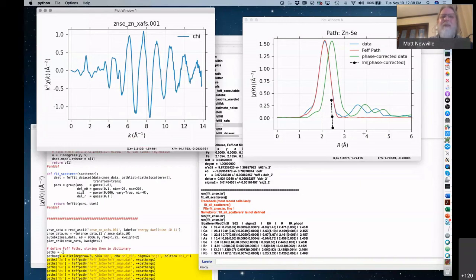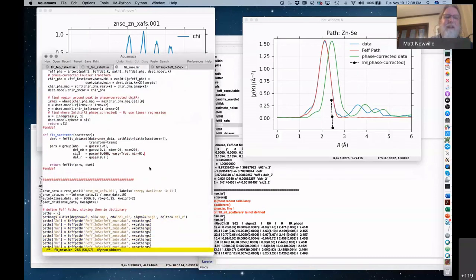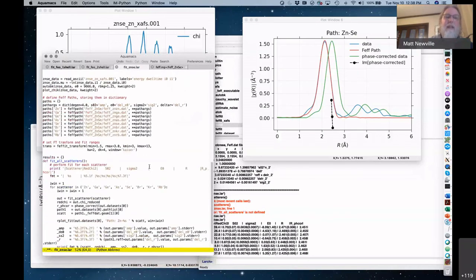Anyway, I know that example is possibly mind-blowing or advanced practice, but it's also the kind of thing you can do with these tools, right? You can just calculate what zinc gallium should be. And again, I just substituted those and reran the FEFF calculations, saved those files.